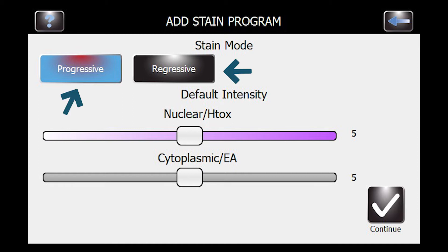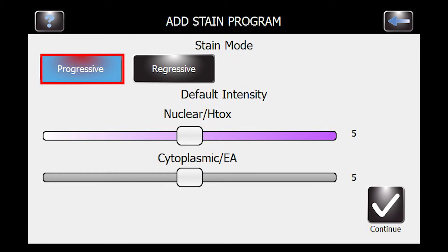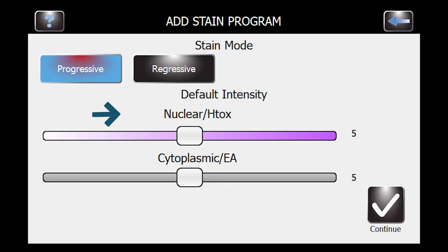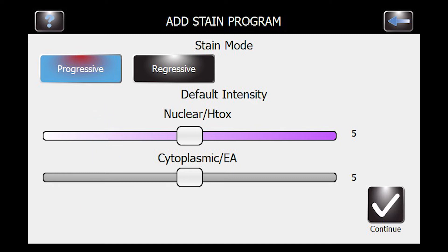Today we'll start with progressive. The GUI gives you the option of separating nuclear and cytoplasmic staining to get started. We'll do H-tox of five and EA cytoplasmic of four. Go ahead and hit continue.